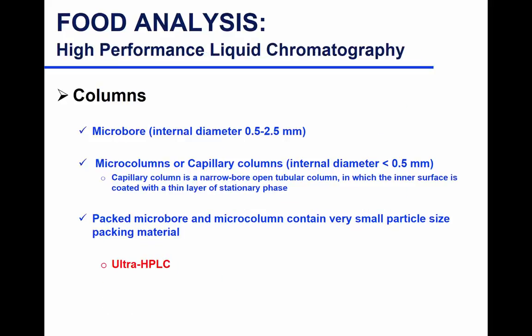With ultra HPLC, analysis time is really fast. It can be 5 minutes, 10 minutes. Yes, you could change your HPLC to an ultra HPLC just by buying a column. They're usually expensive, and usually you cannot load a lot of sample on it. Good to use, but it depends on what you're analyzing and your need for it.